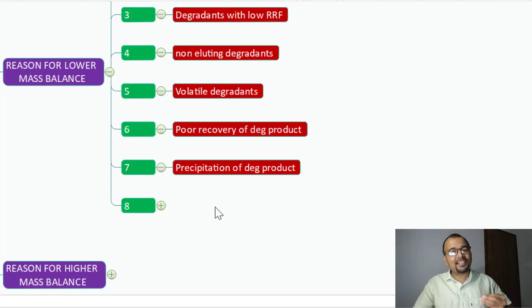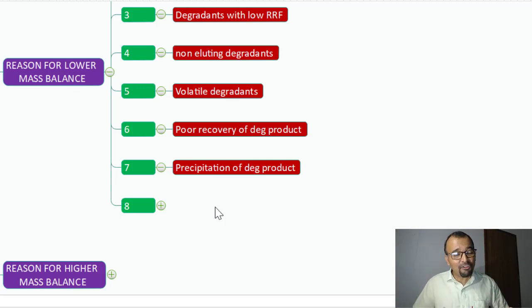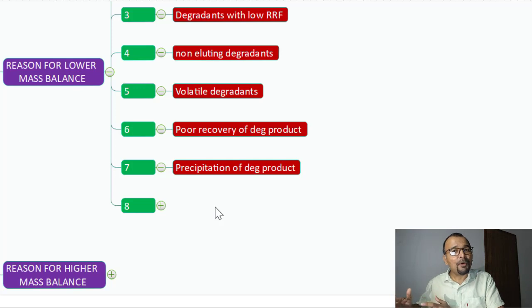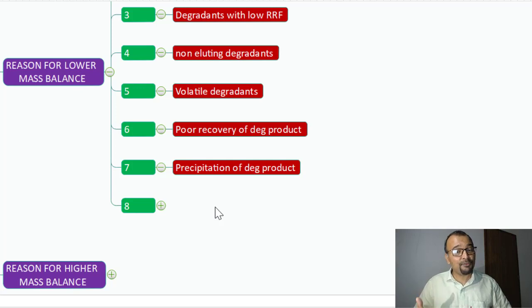Precipitation of degradation products. If your API is soluble in the given solvent system but the degradants generated during treatment do not have adequate solubility in the selected diluent, they will get precipitated out. If you separate out this undissolved mass through filtration or centrifugation during sample treatment, you are going to lose a good amount of mass during analysis, causing a short mass balance.